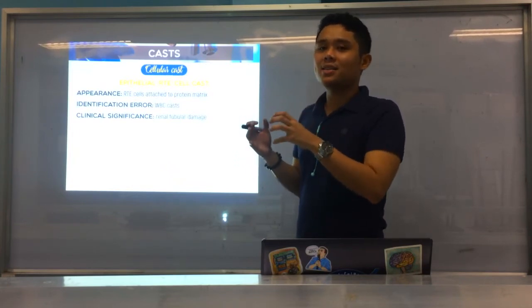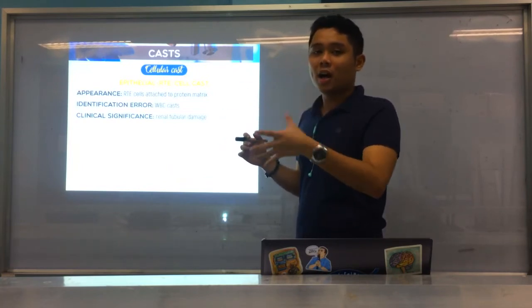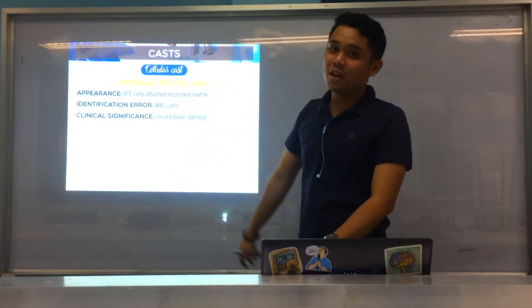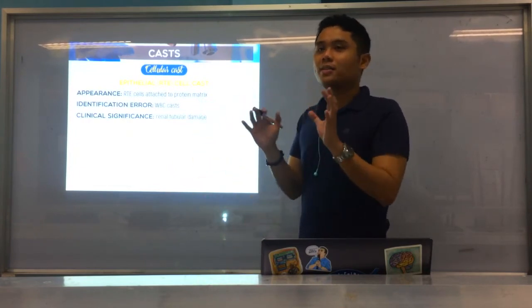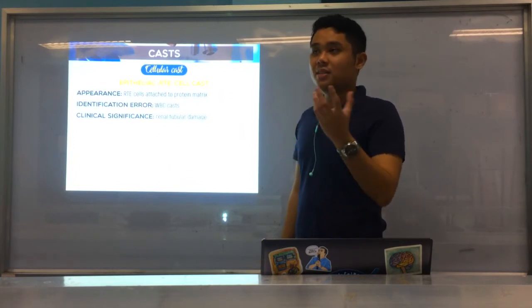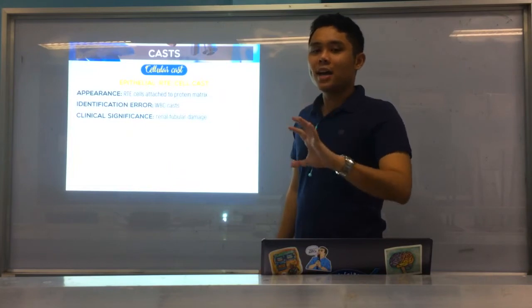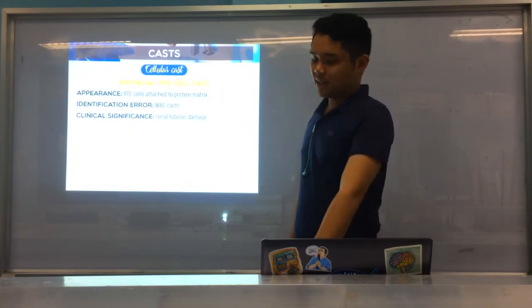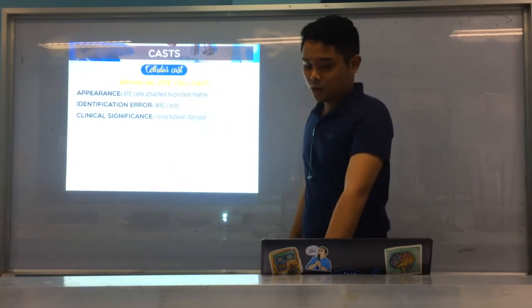So, while the cast is made, basin pag tangtang, pag excrete sa cast, naay usa or duha ka RTEs na maapil, okay? But if daghan na jud kaayo siya, then that could be na naay damage sa imuhang renal tubules. And iyang identification error is WBC cast since quite same ang appearance sa WBCs and RTEs. But the difference is if stain mo, ang nucleus is eccentric sa RTEs and medyo mas dako ang RTE cells compared sa WBCs. Ang pinaka-significance is damage sa imuhang renal tubules.